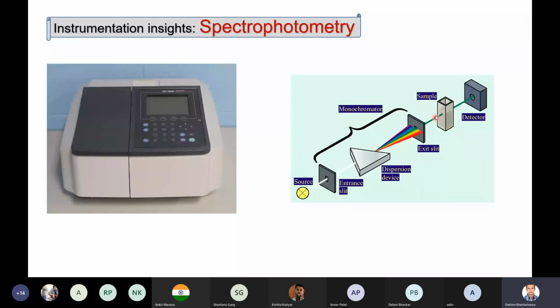This absorbance of the light by the solution, or the water or whatever the solution is within the glass, is the optical density of that solution. The term optical density, or for simplicity at this moment absorbance, is very common in any type of chemical reaction. This term you will come across, the optical density or absorbance of a particular solvent or solution.